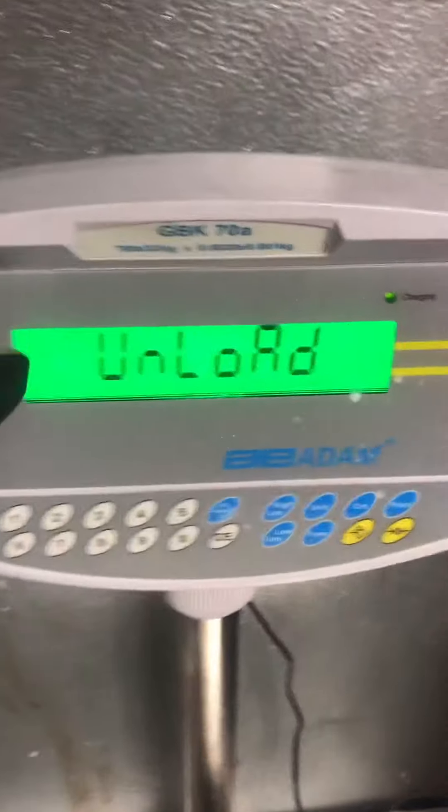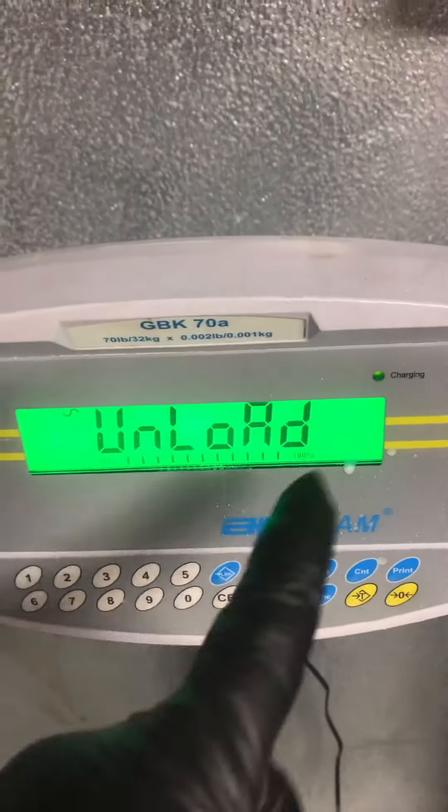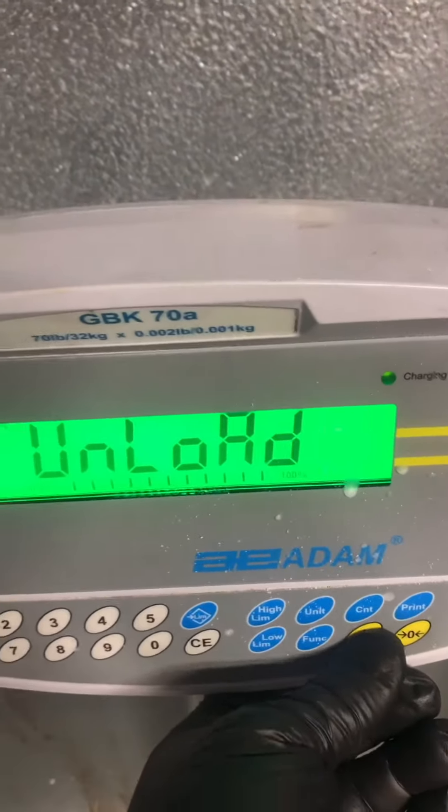It reads unload. Always see that little squiggly line — that's a stable line — always make sure that that's on before you do anything. Unload does a zero adjustment. Press the tear.